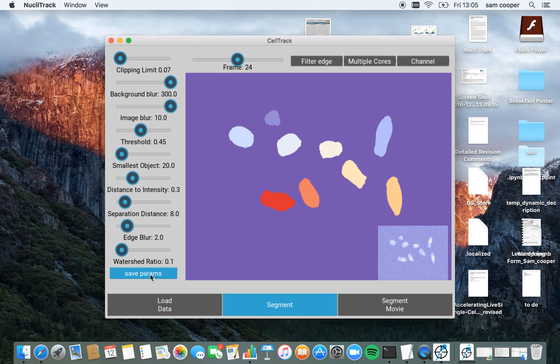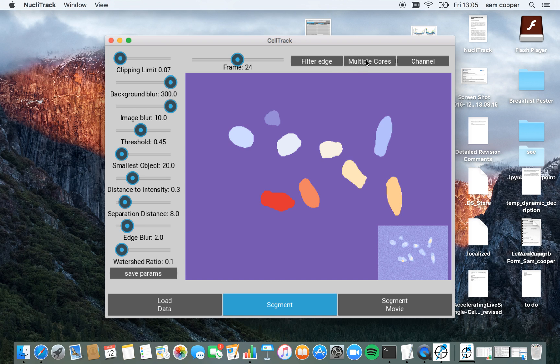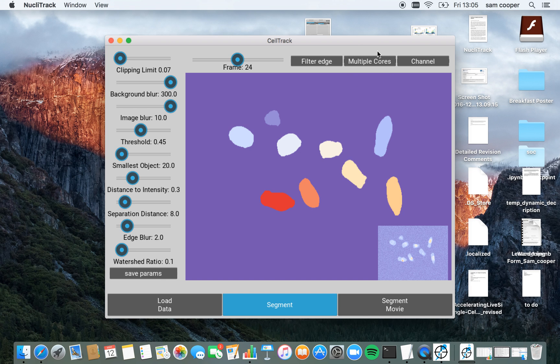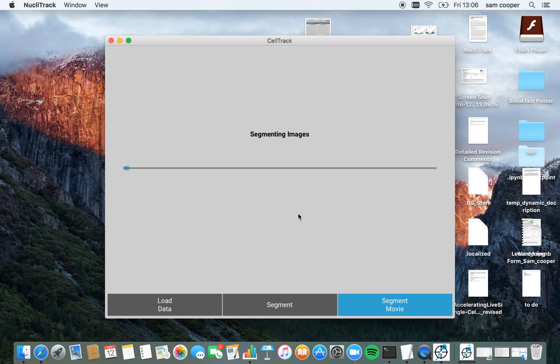I'm going to now save these parameters for segmentation. I have the options here to also filter cells which are touching the edge of the image, or use the multiple cores available to me on my laptop. But I'm going to leave this, as this series of images is not very big, I'm just going to proceed without using multi-processing. So, I'm going to now segment the entire movie by pressing this button here.